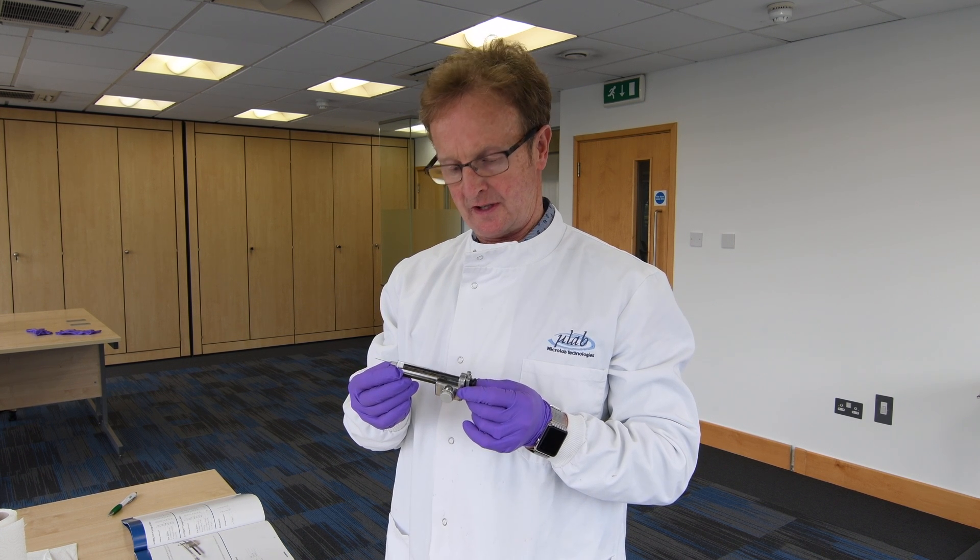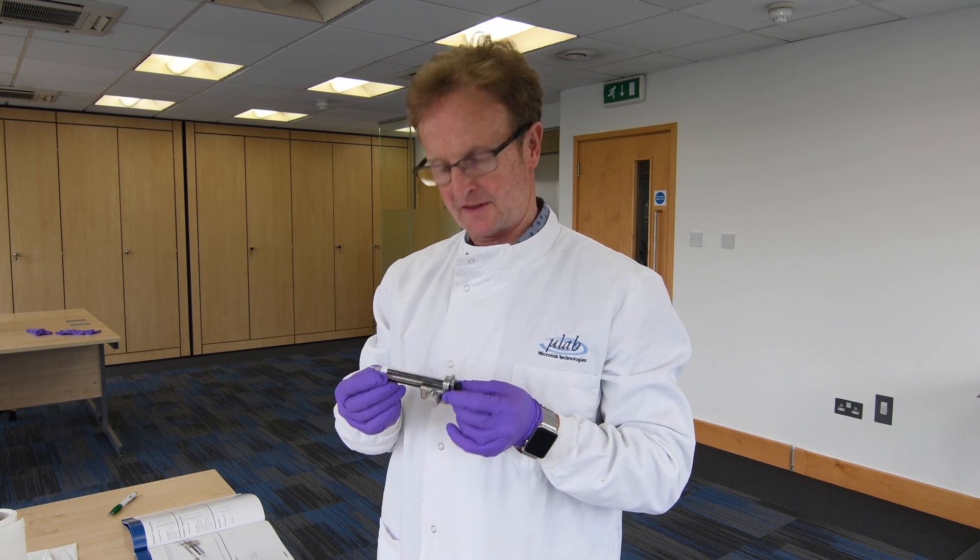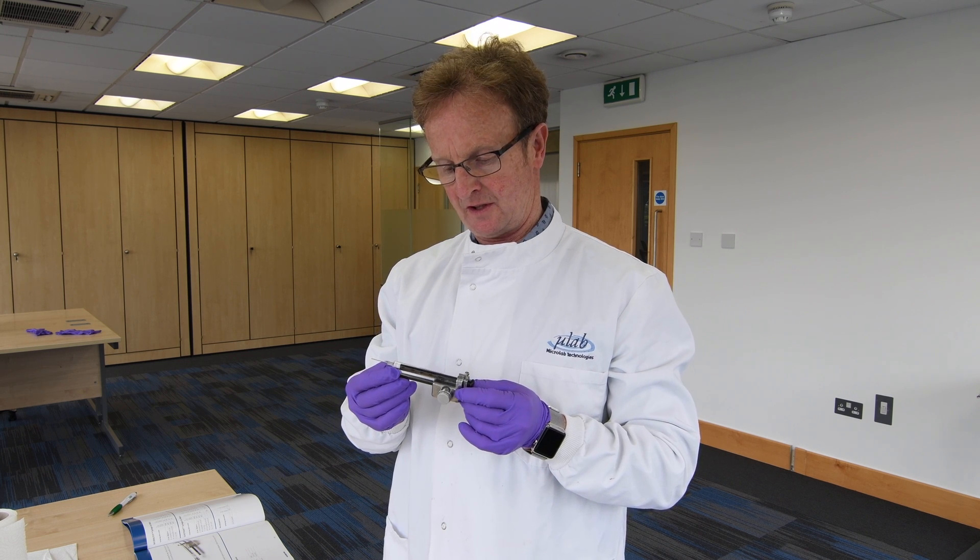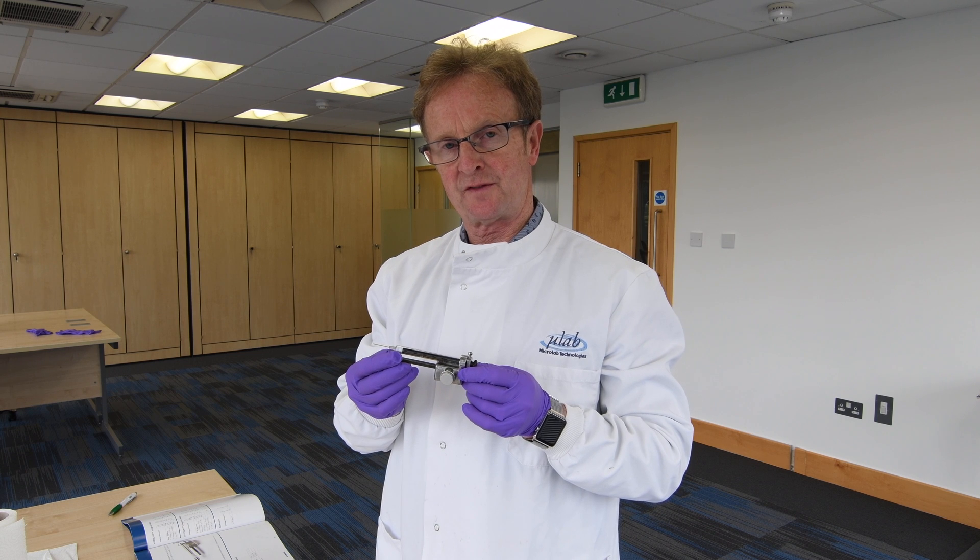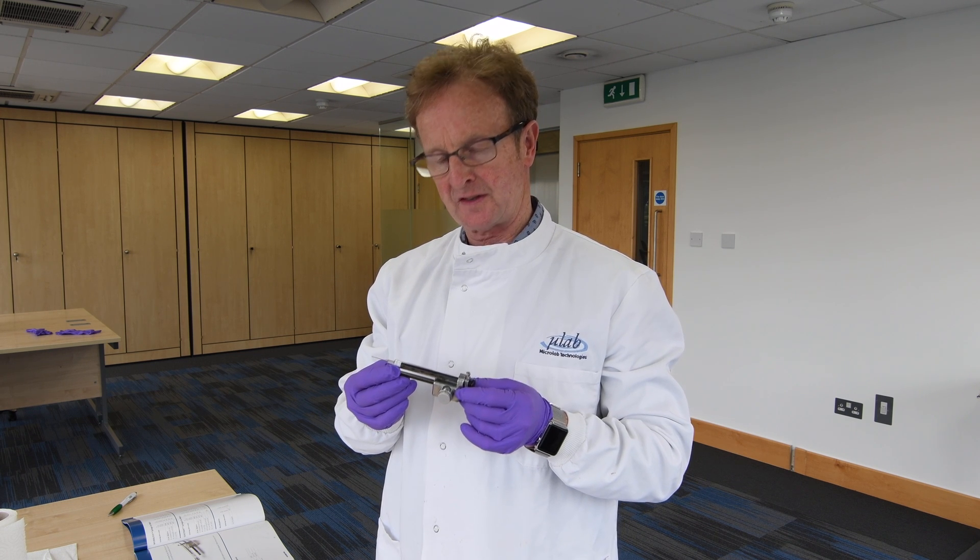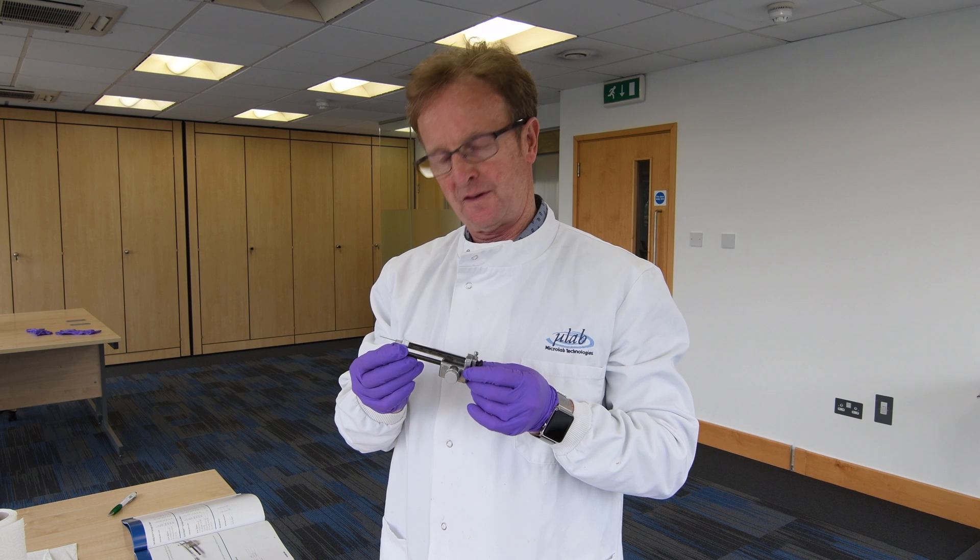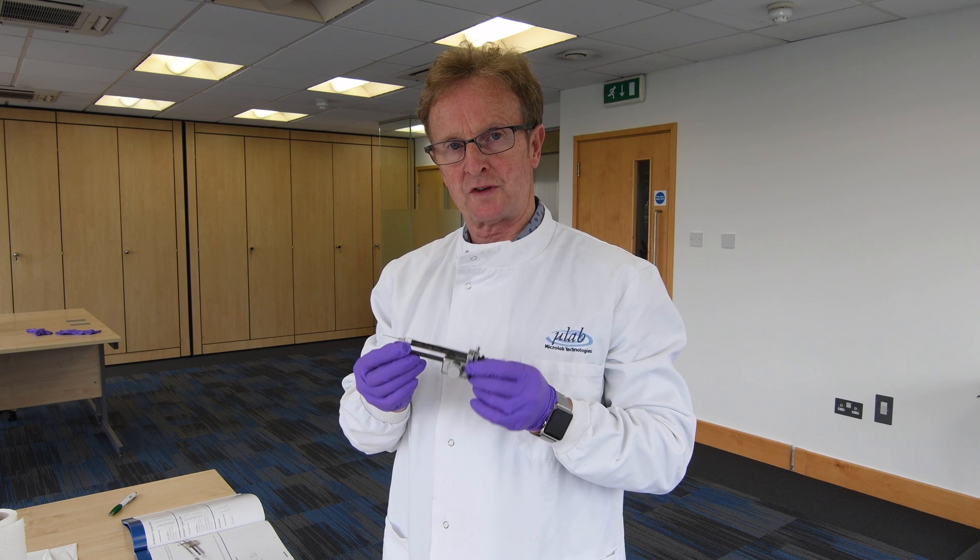This is a PB600. It's a mechanical device designed and patented by Hamilton, which used in conjunction with their syringes between 25 microliters and 2500 microliters, allows us to give 50 incremental volumes of the syringe volume.